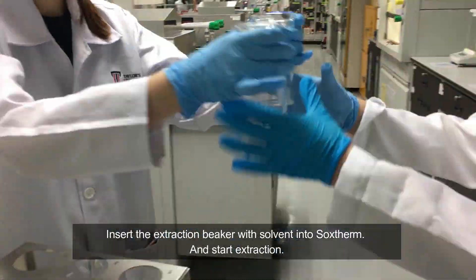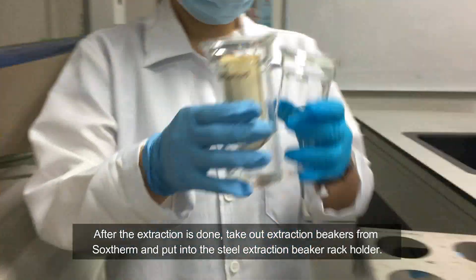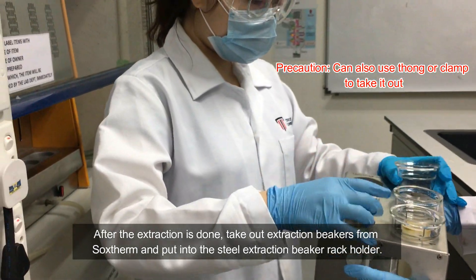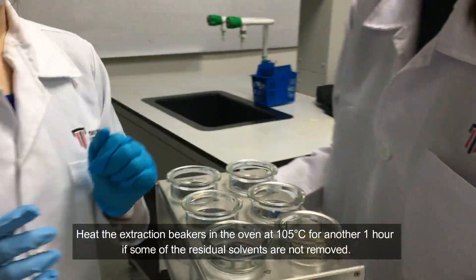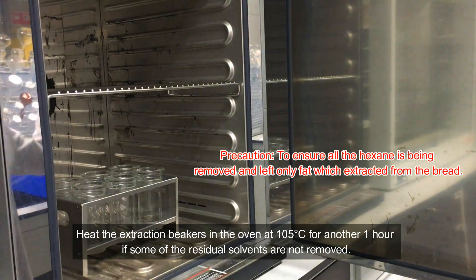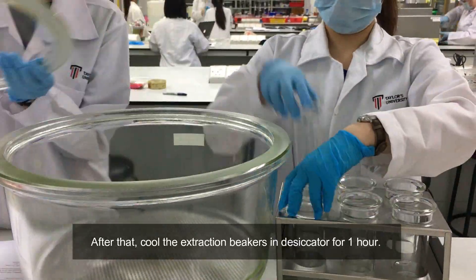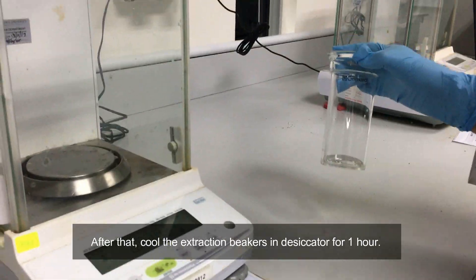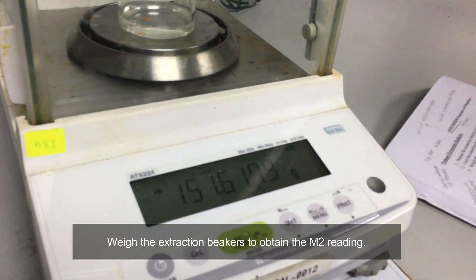Insert the extraction beaker with solvent into the Soxhlet. After the extraction is done, take out the extraction beaker from the Soxhlet and put it into the steel extraction beaker wrap holder. Keep the extraction beaker in the oven at 105 degrees Celsius for another 1 hour if some of the residual solvents are not removed. After that, place the extraction beaker in the desiccator for 1 hour. Weigh the extraction beaker to obtain the M2 reading.